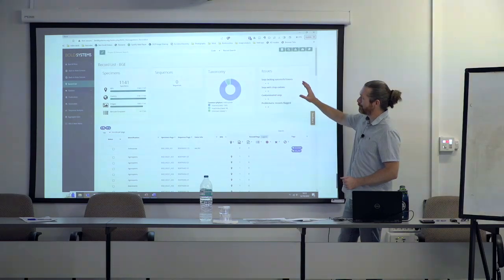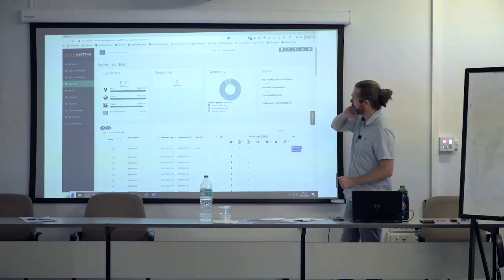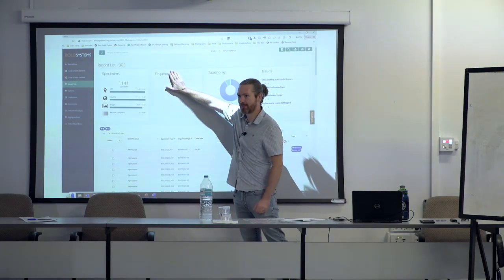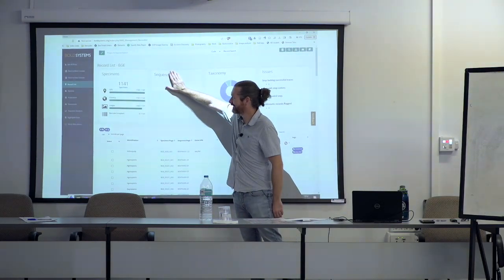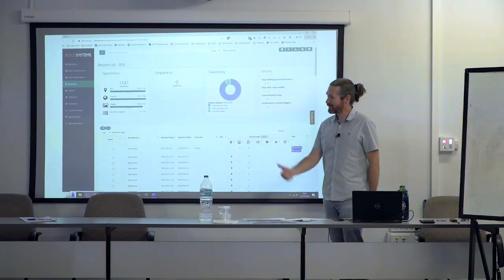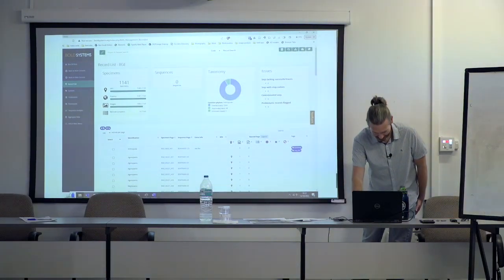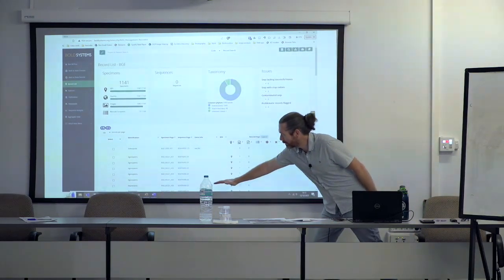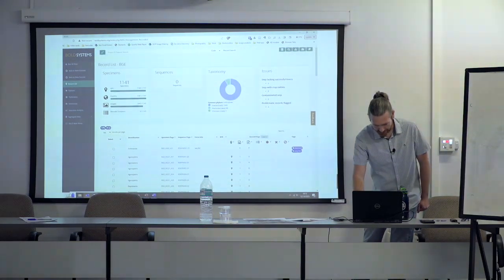Anyway, so this is the current record list in the BGE container. Ignore that, seeing as I'm work package 6 lead. They're coming. There's lots coming, but just ignore that for now. By Barcelona, there'll be numbers in there that are not 0. The reason I showed this is just because you get all your records on the page here, and you can select one of the records.